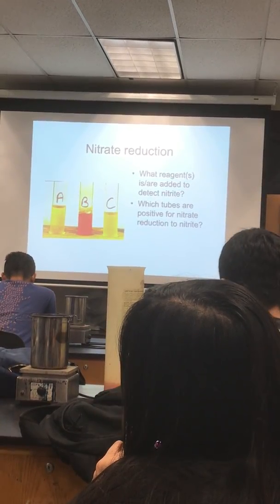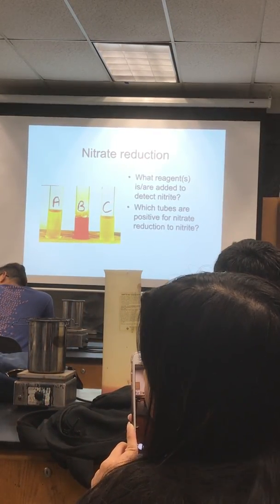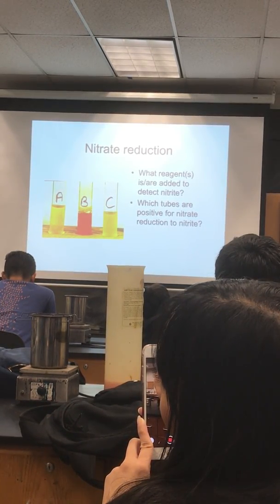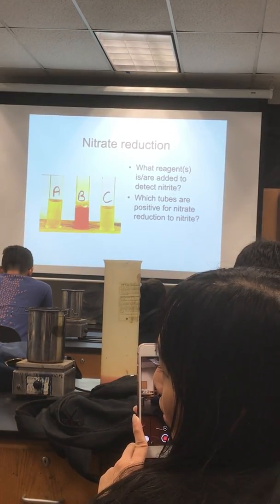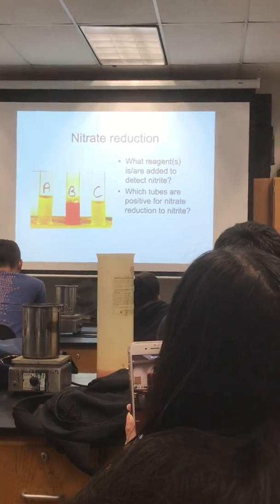Okay, so what reagents are added to detect nitrite? Alpha-naphthylamine and sulfanilic acid. Okay. Which tubes in this are positive for nitrate reduction to nitrite?